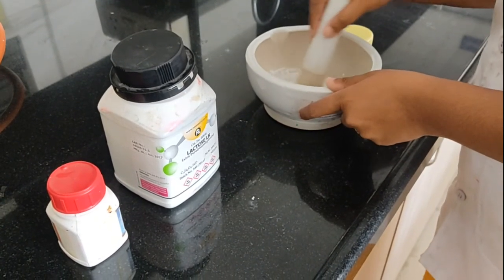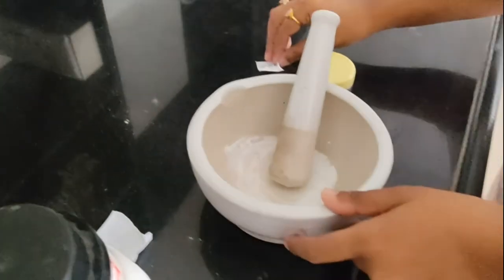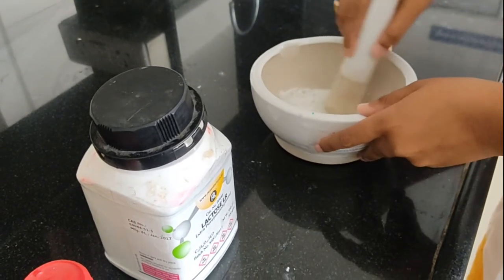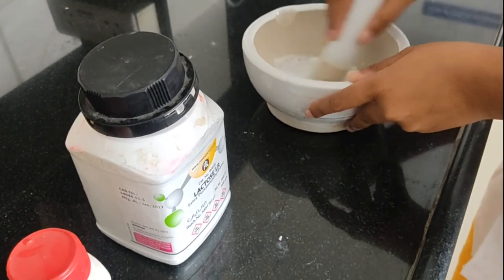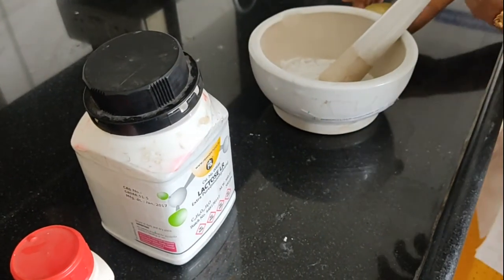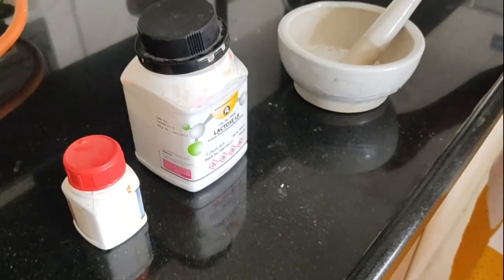Trituration is performed to reduce the particle size and to achieve proper mixing. Again, after trituration, I am going to add the remaining amount of the diluent lactose and again proceed for trituration. After proper mixing of both the powders, now I will transfer this onto the white paper, then wrap each single packet, and after that it should be put into this container, and then we will proceed to the labeling part.